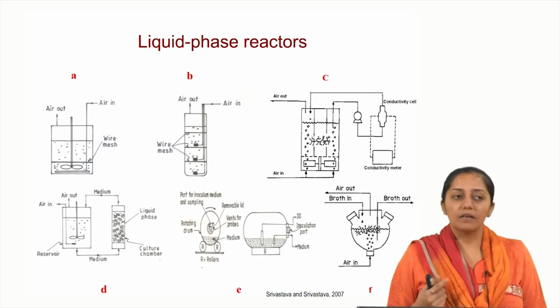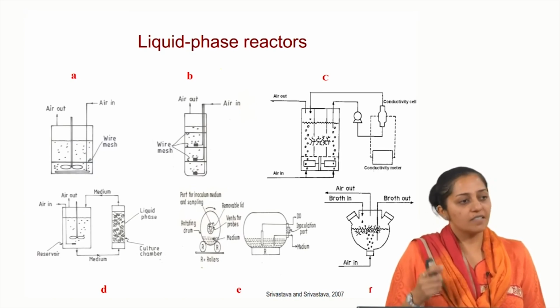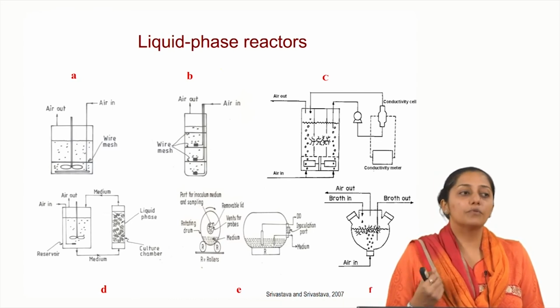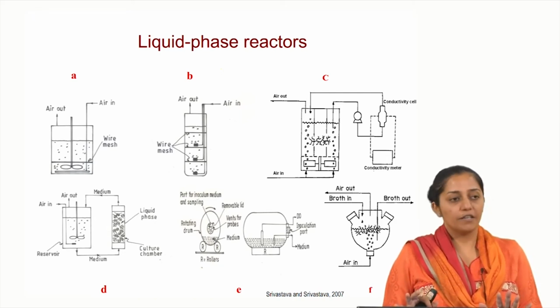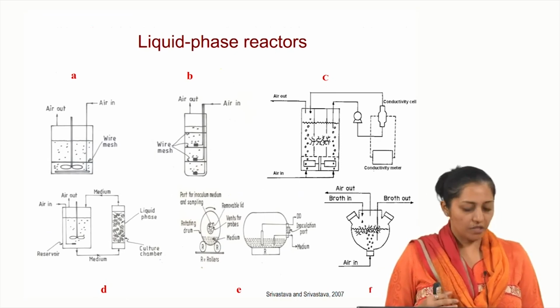So, then what can be a way to overcome this problem? You need support. The roots will grow like this, they are self-immobilizing, you cannot disperse them. So, how will you improve? What strategy would you use to improve mass transfer? What can you do? These are the kind of reactors which we know, generally used. Now we know what the challenges are.